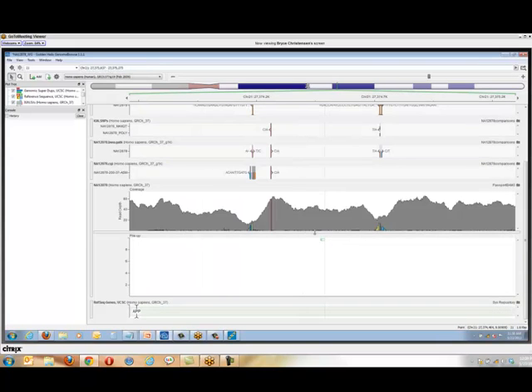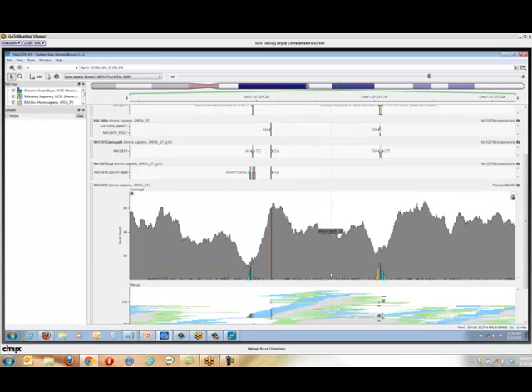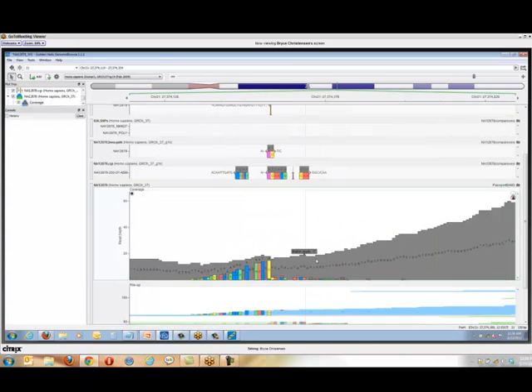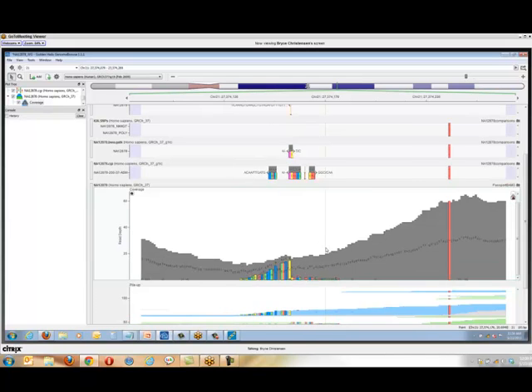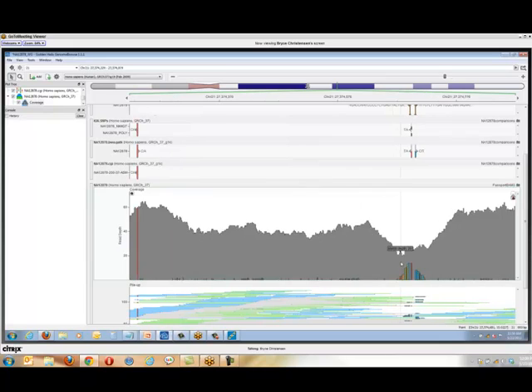And we'll start by just looking at this histogram view here at the top. The thing that gives this away, if we zoom in right around here, we see that we have all of these that are in gray. That means that the reads in our pileup match with the reference sequence. Then out here we've got a bunch of colors indicating we have a lot of mismatches. And then similarly, come out here to the other end of the inversion, we see the same thing.